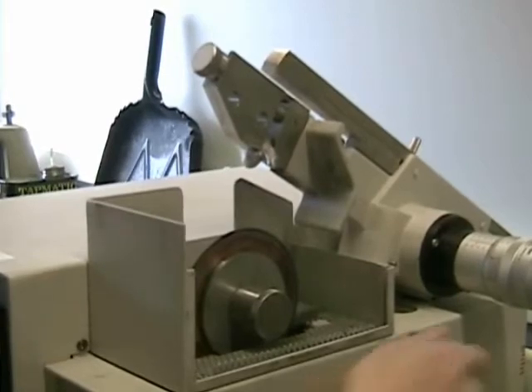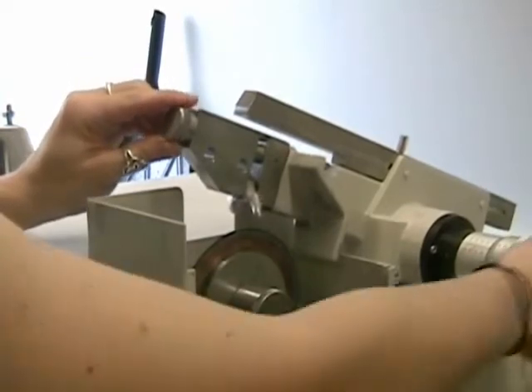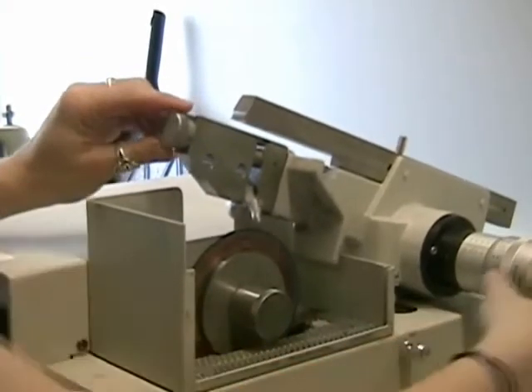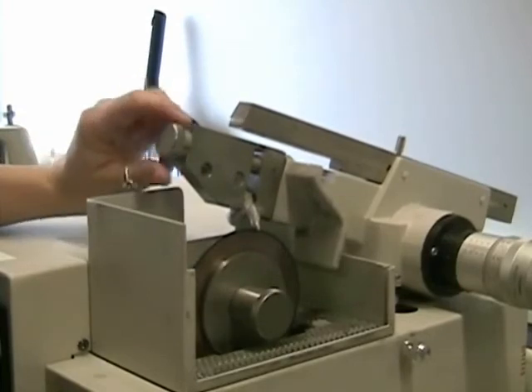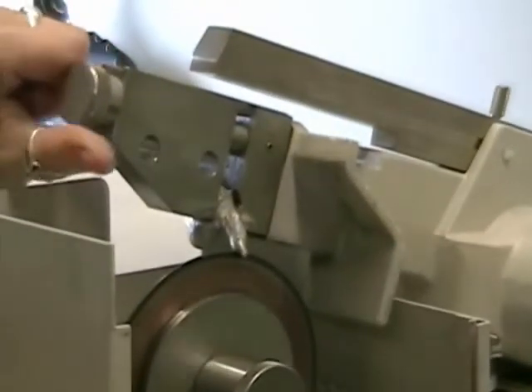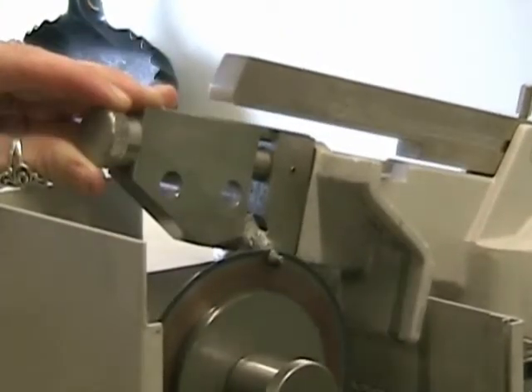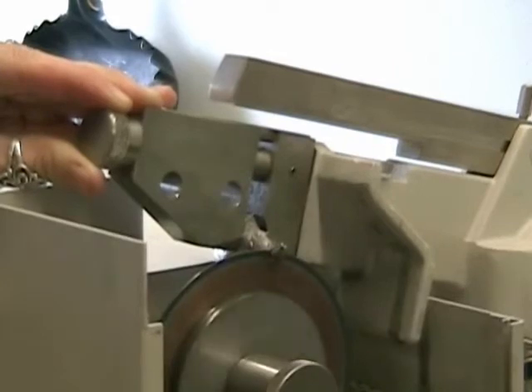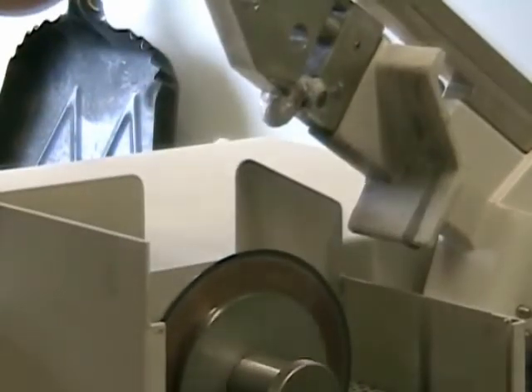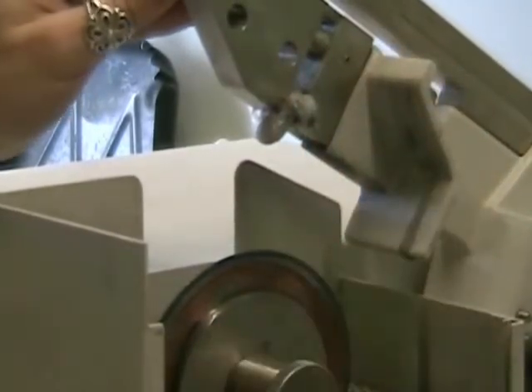Notice the sample is in the saw arm, which is now being lowered. Turn the blade on and wait for the sample to be cut. Turn the blade off when it's cut through. And there's your sample.